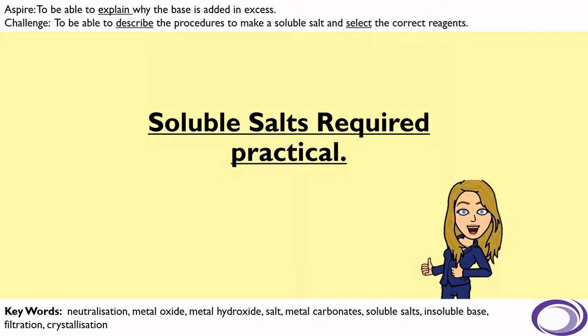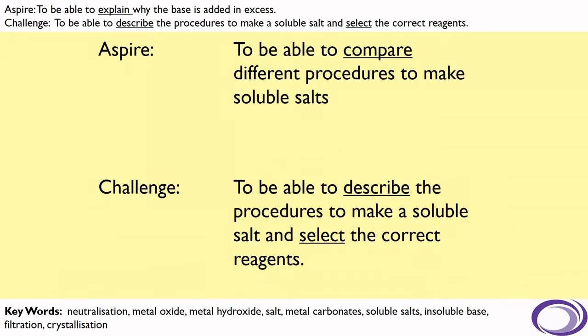In today's lesson we will be looking at the soluble salts required practical. Our challenge is to be able to describe the procedures to make a soluble salt and select correct reagents. Our aspire is to be able to compare different procedures to make soluble salts.